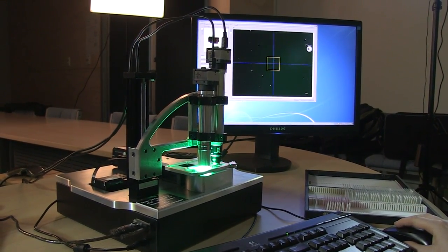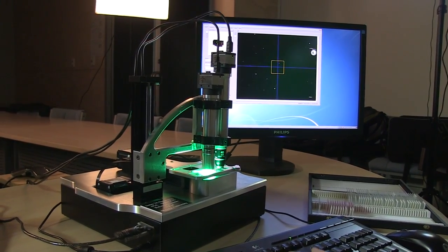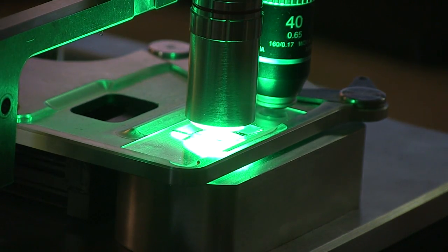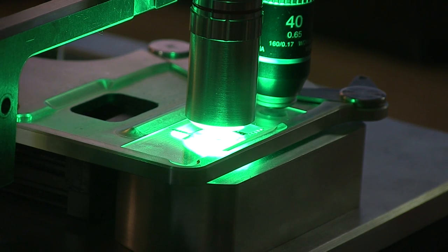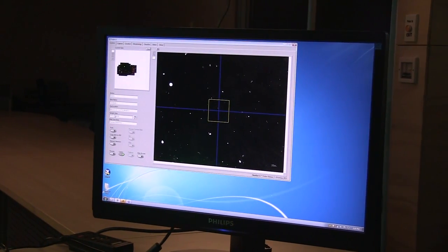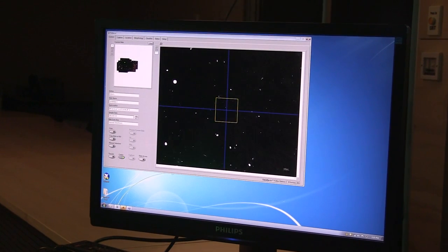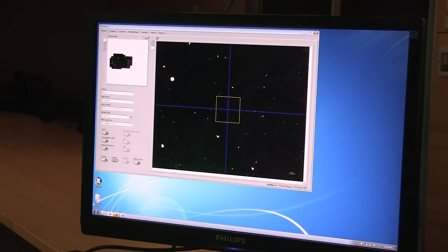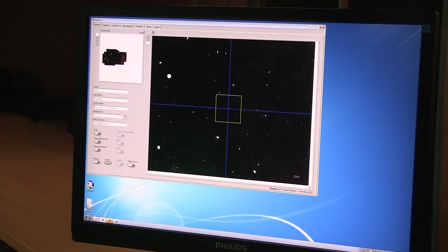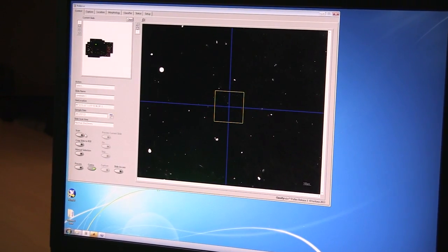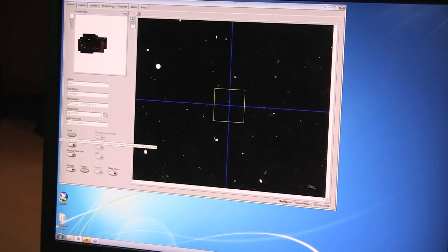We can then give this slide a name and so we can add the geolocation information so that the site where the sample was collected from, and we also add a date which the sample was collected, and this information that we enter here is tagged on to every single image file that is collected from this slide.